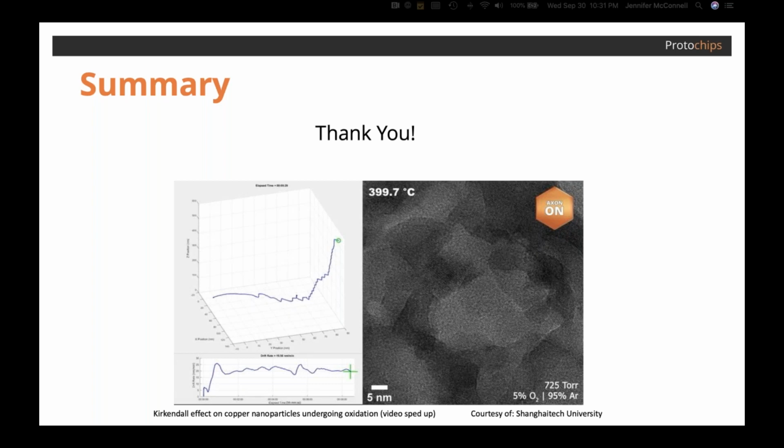So again, the intranet connects the AXON core to the camera and the TEM computer, and then an internet connection only to the AXON core facilitates an outside user actually seeing their dashboard for the TEM session. The great thing there is you don't need the TEM computer itself connected to the internet.